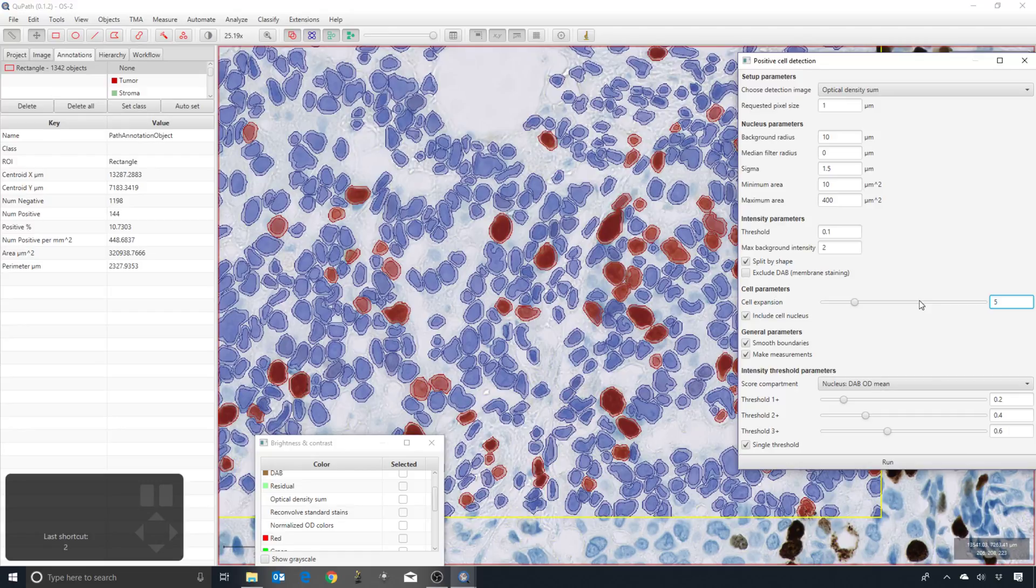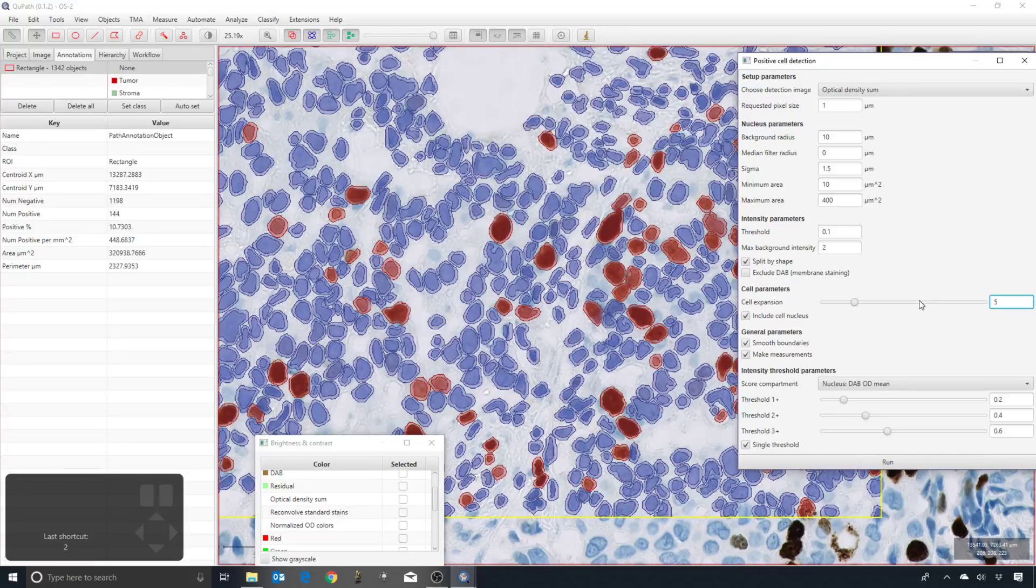Then we get additional measurements on the nucleus-to-cell area ratio, and this becomes important when we're trying to train the tumor classifier.